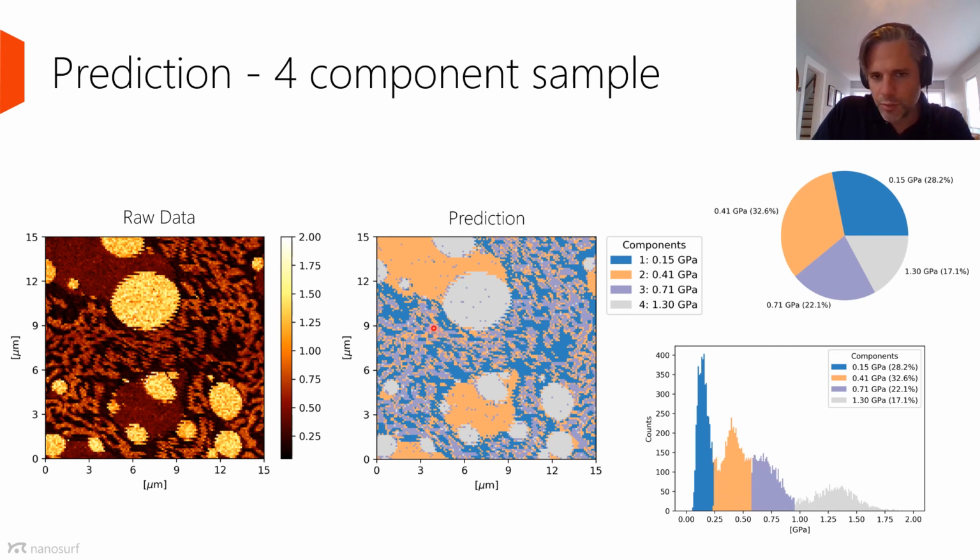And what that's going to correspond to, and we can see that in the image here, is that this second component is labeled throughout the center of this. And so what I see is maybe a little bit of an error in this Gaussian mixture model, where it's assigning this mixture between the blue region and the first component and the third component, and it's assigning it to the second component.